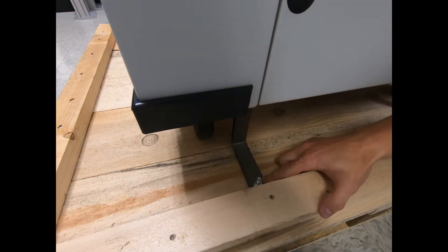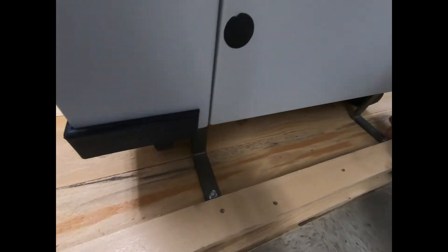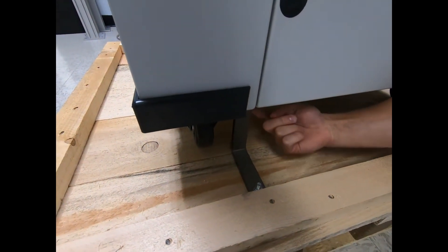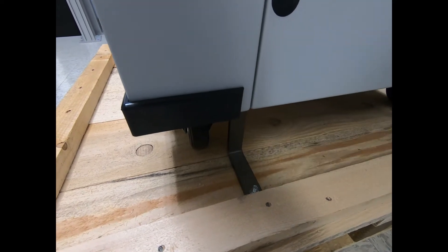You're going to want to remove four bolts that the bracket is bolted into the pallet. There are also four corresponding bolts bolted into the actual unit as well that you're going to want to remove.